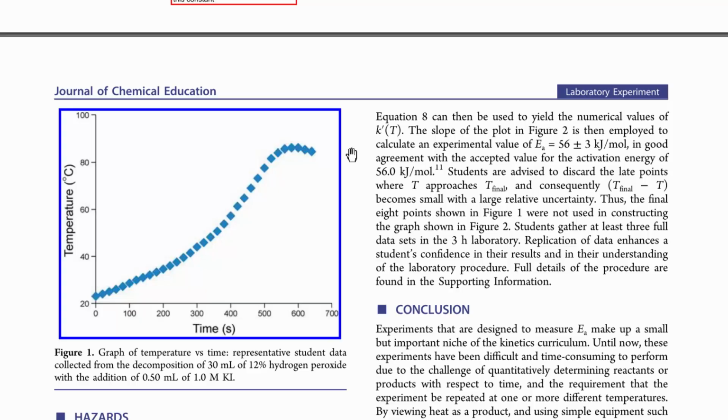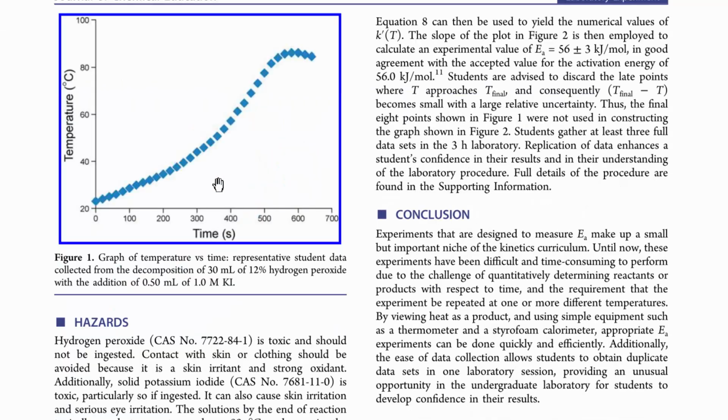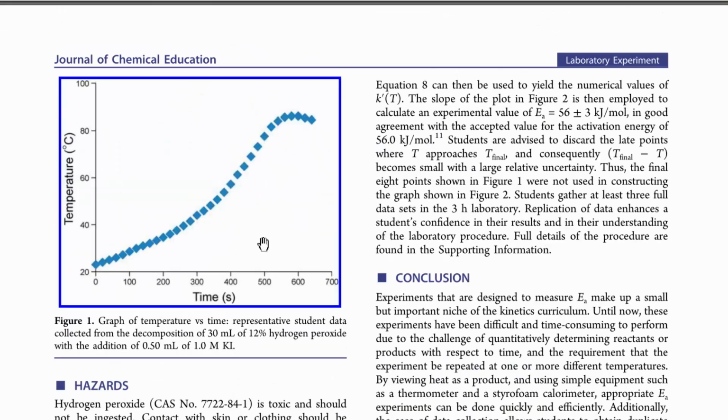Okay, so just so I don't have to come back to this document again, just a side note. My reaction was far less steep. These guys went up to 90 after 600 seconds. So we'll just remember that.